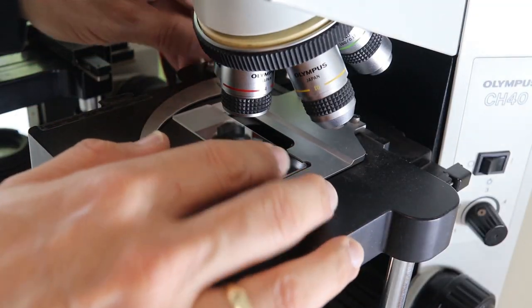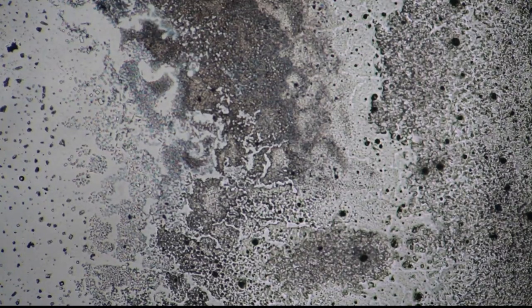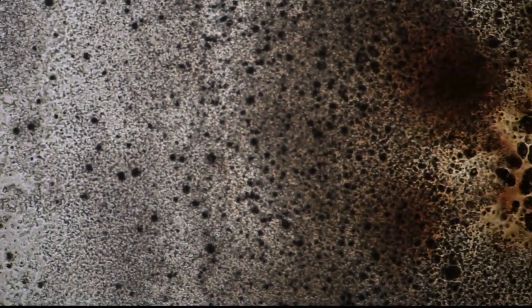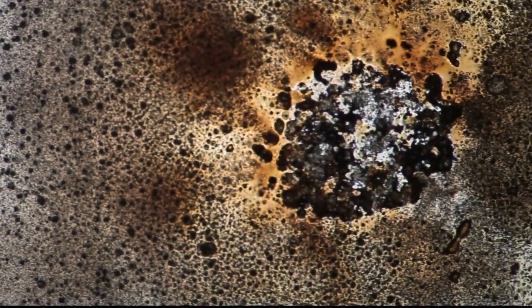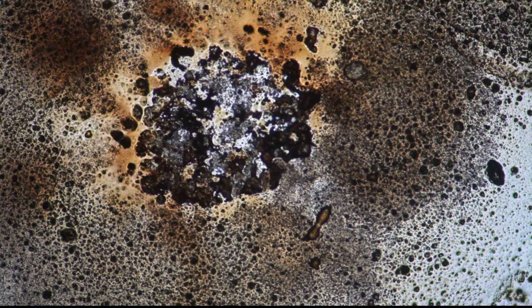So first let's have a look at it without any filters. Of course it goes directly under low power objective to get an overview, it looks a little bit messy. But as we start to move to the place where the match is burned, it does look a little bit artistic. Actually, I might actually frame the picture.